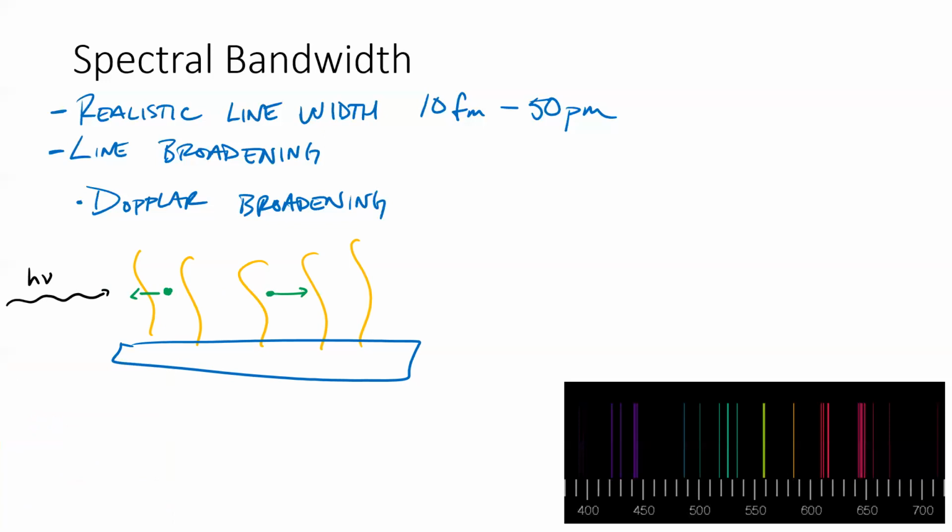If they're moving toward one another, then that molecule, right, will absorb at a slightly higher frequency than if it's moving away from it. It'll absorb at a slightly lower frequency, right? So this guy here seems to have a slightly higher absorption frequency. And this one will be slightly lower.